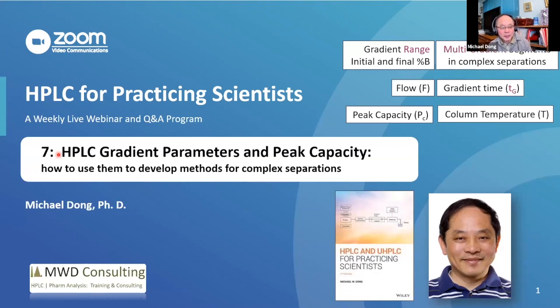So really two things. And I'm going to actually talk about how we use them to develop methods for complex separation. I know that we really did not talk about method development yet, which is kind of a big topic, which is coming later on in the second part in pharma analysis. How do you develop methods properly? We started to talk about a different way of doing method development, right? So it's going to be a little bit extra for somebody who's more advanced. So if you don't know that part of it, don't worry about it. We will talk about it in more detail.